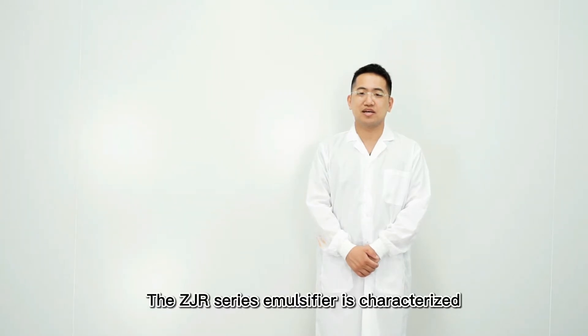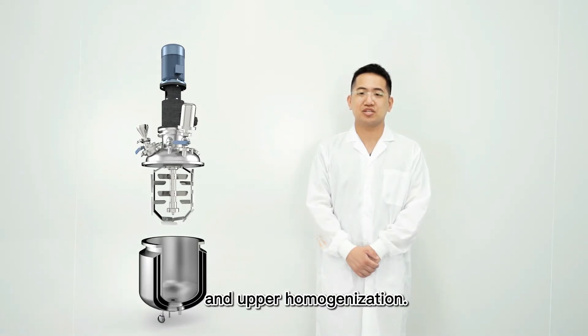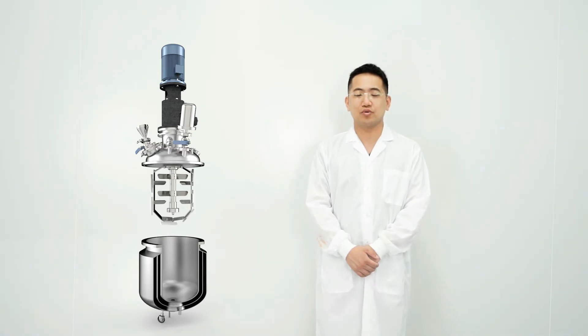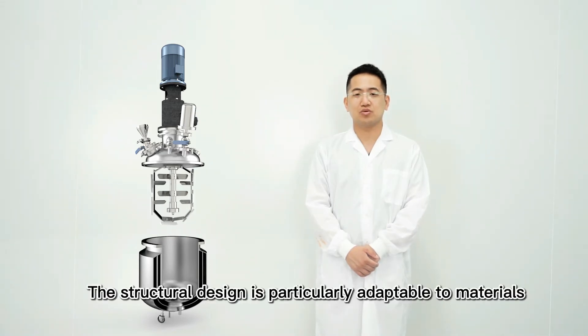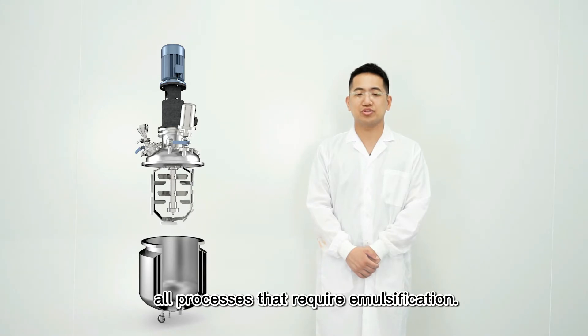The ZJR series emulsifier is characterized by a structure that combines counter-rotating wall mounted stirring and upper homogenization. The structural design is particularly adaptable to materials. It can be used in almost all processes that require emulsification.